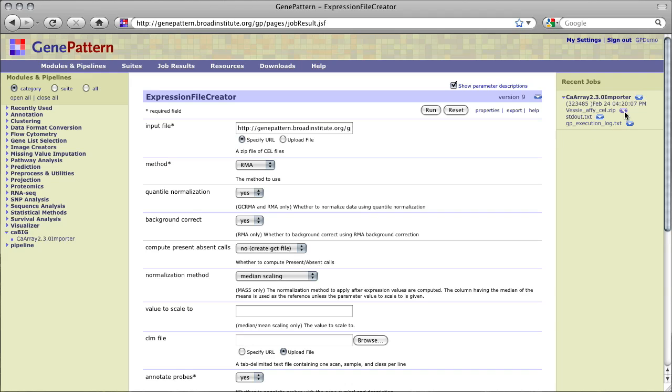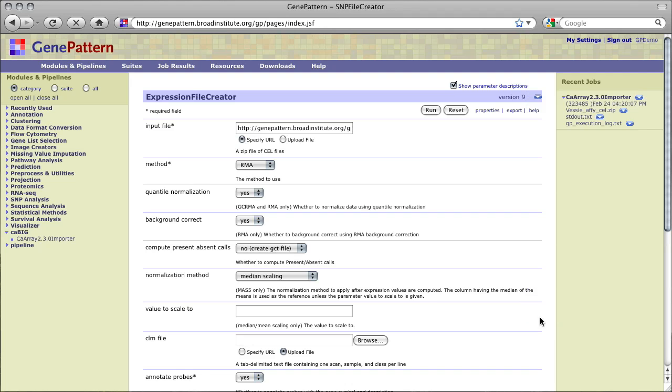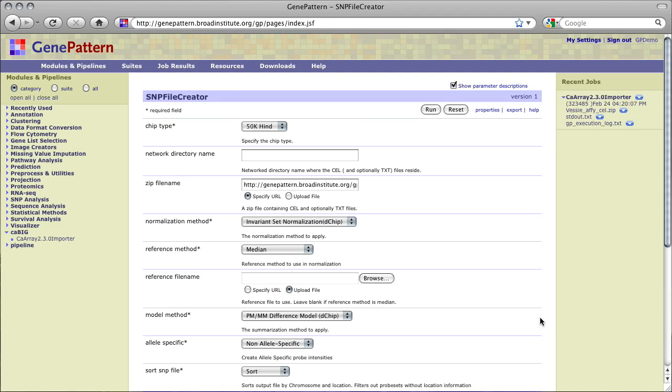If we had imported raw Affymetrix SNP chip cell files, we could take our .zip output and pass that to SNPFileCreator to convert our SNP data into the .SNP format for further analysis in GenePattern.